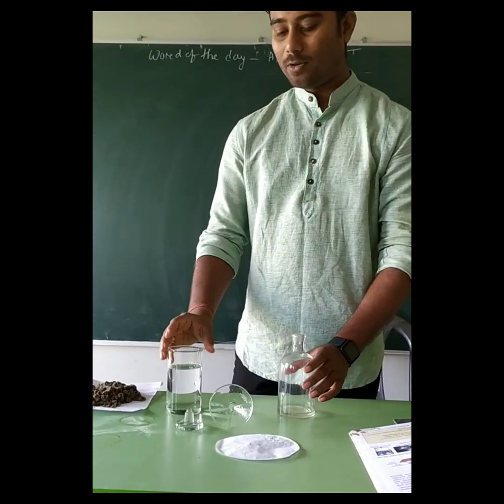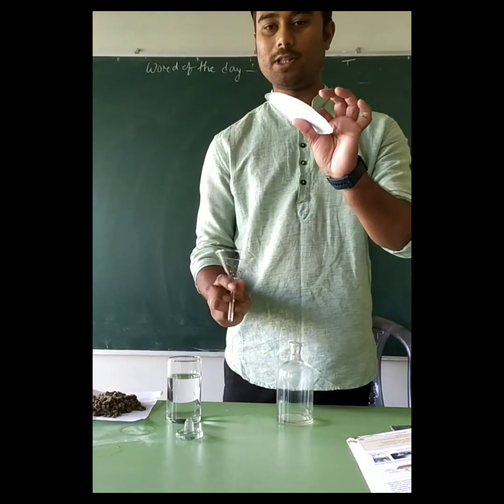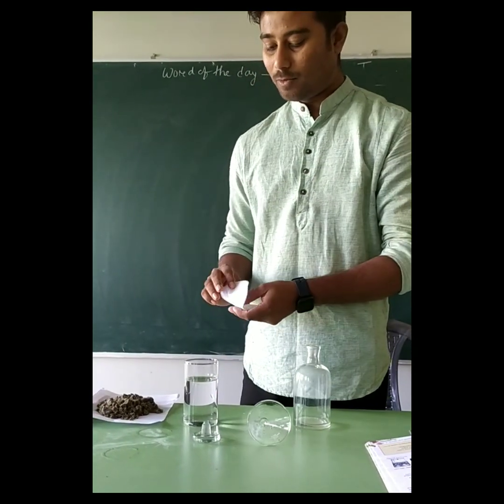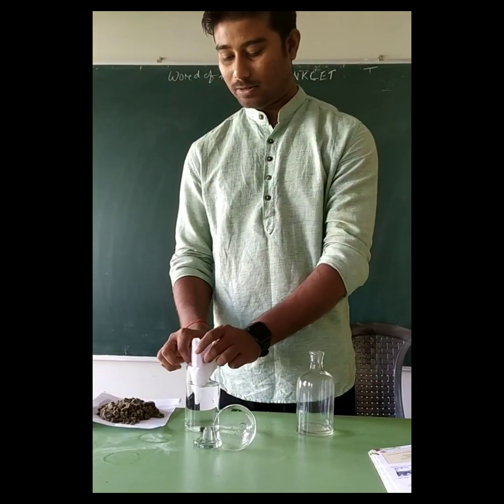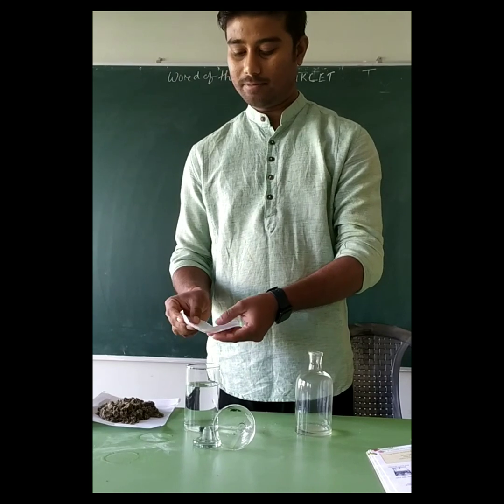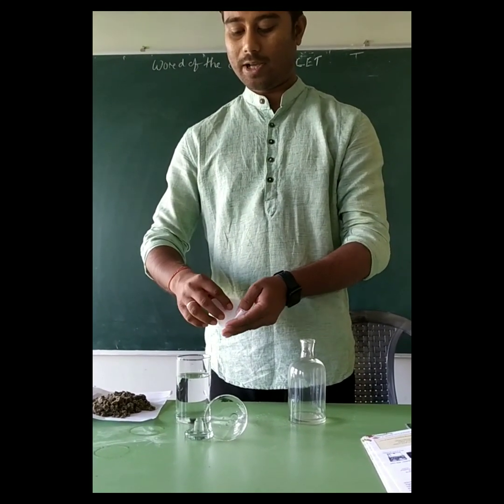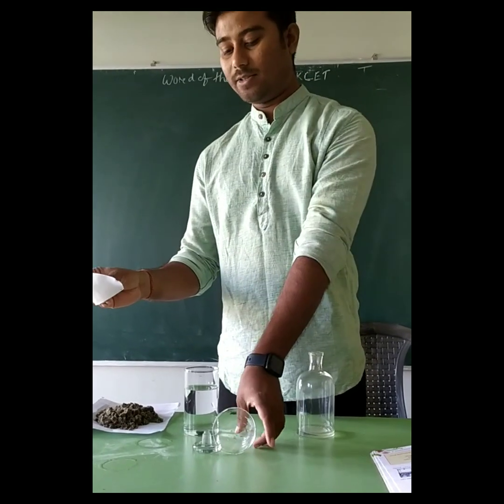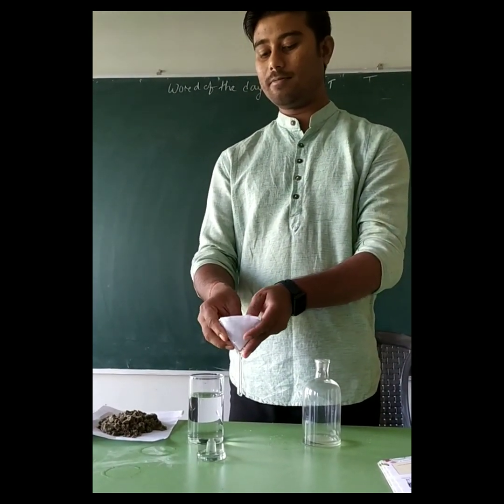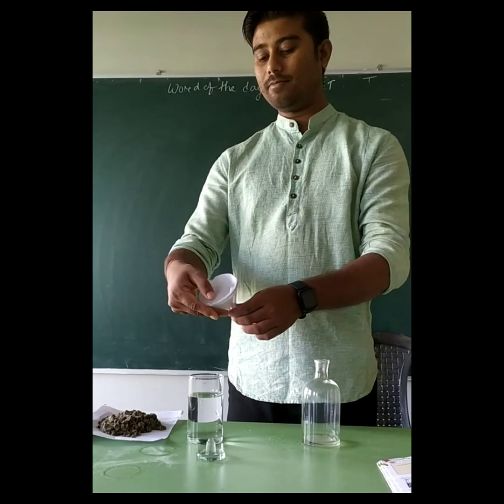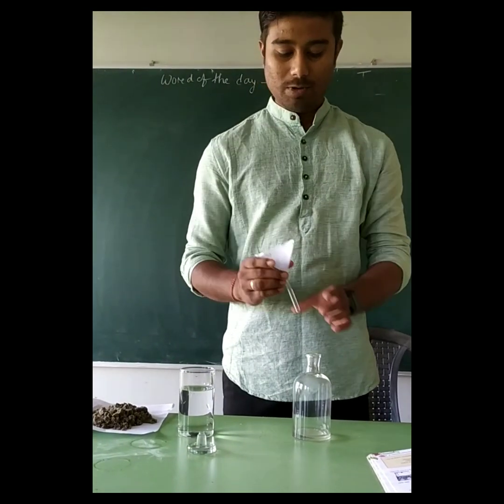Now we will filter water. First of all, this is filter paper — we will put some water in it. We will make it a triangular shape like this, and then fix it in the funnel like this. And then we will put it here.